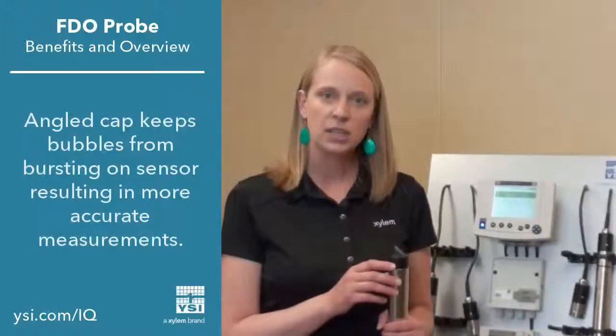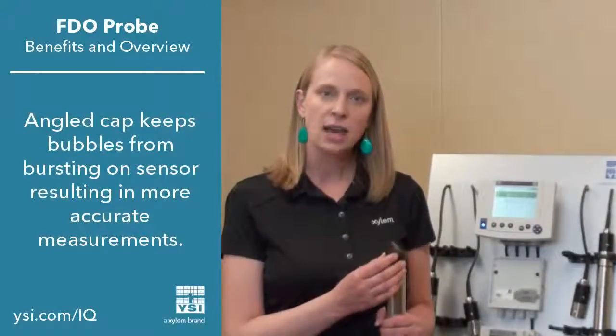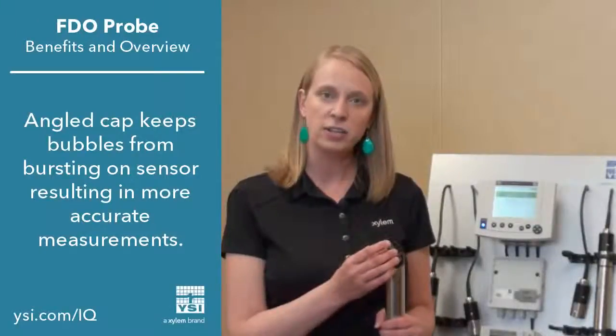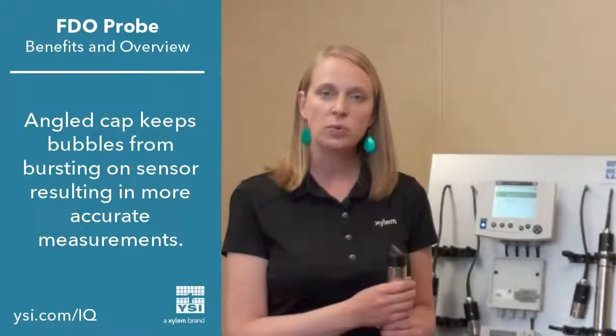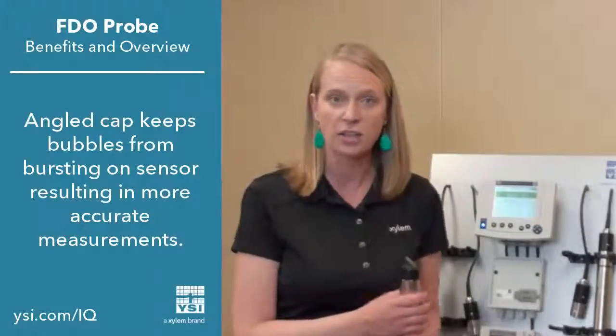In addition, our optical dissolved oxygen cap is angled. This allows air bubbles to glide across the surface, not allowing them to get caught on the surface or burst on the surface, which results in increased dissolved oxygen readings or artificially high dissolved oxygen readings.